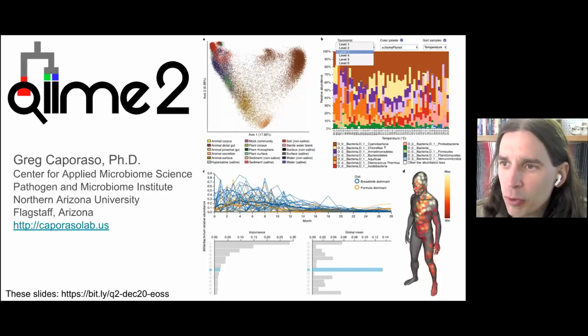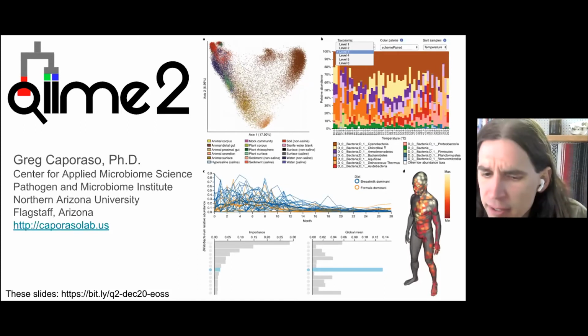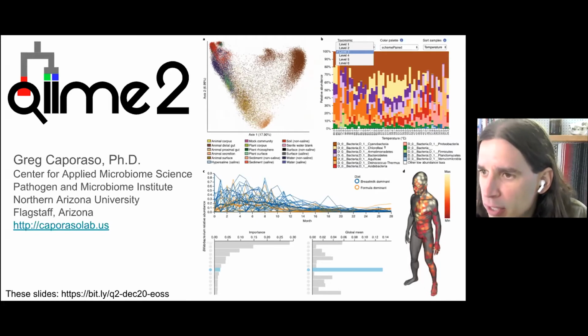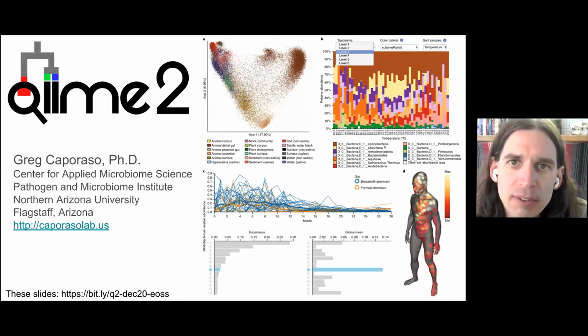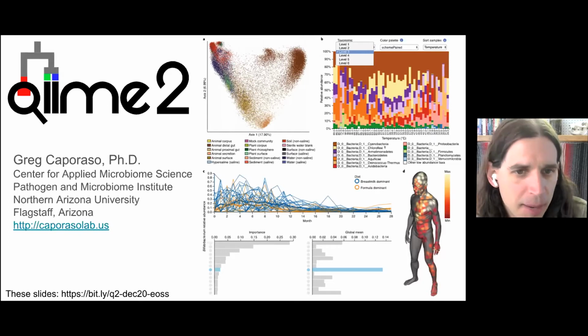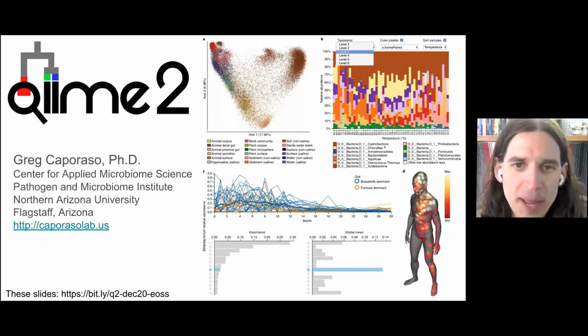Okay, well, thanks everybody so much for coming. I'm going to talk about the QIIME microbiome bioinformatics platform. This is a very widely used bioinformatics package for analyzing microbiomes. A lot of people are using this for human microbiome research, studying the literally trillions of microorganisms that live in and on the human body. It's also very widely used for environmental microbiology, food microbiology, all kinds of things that we had never imagined when we first got started on this.